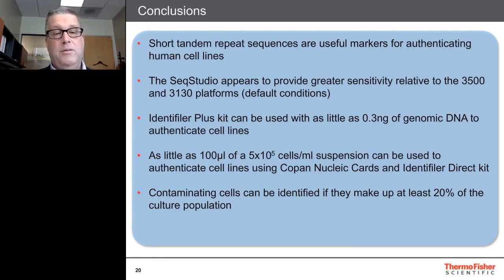And again, when you get a cell line, you might want to get a baseline profile of your cells before pursuing other experiments, so that in the end you can test the cells and make sure they match with what you generated at the very beginning of your workflows.